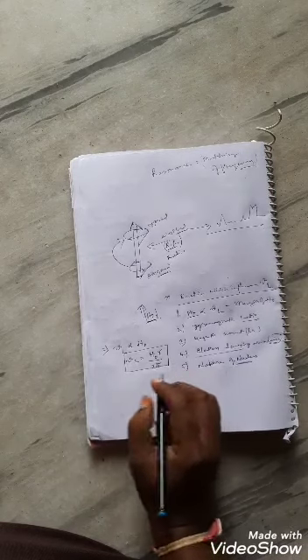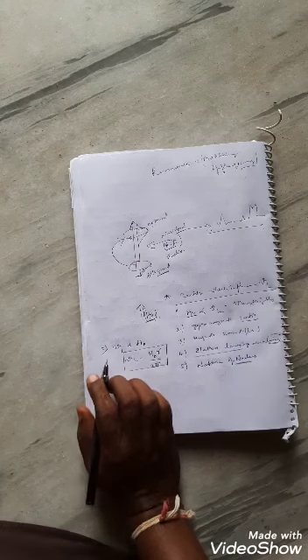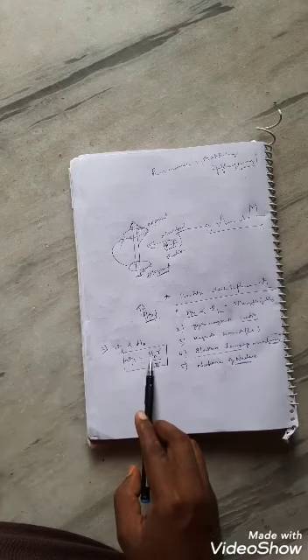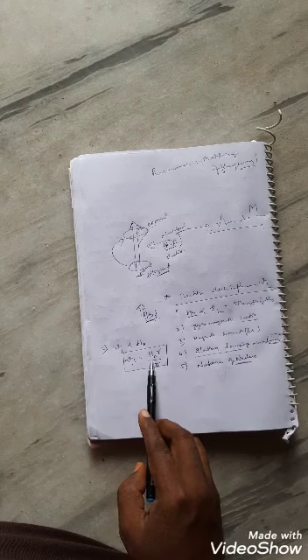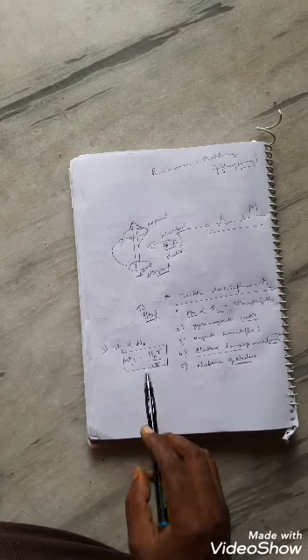So at any given field strength, the Larmor frequency is equal to H naught, the applied magnetic field, times gamma, the gyromagnetic ratio, upon 2 pi.